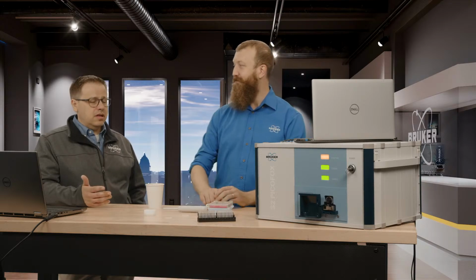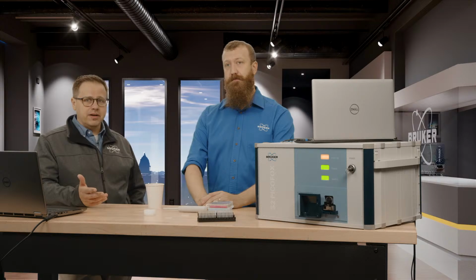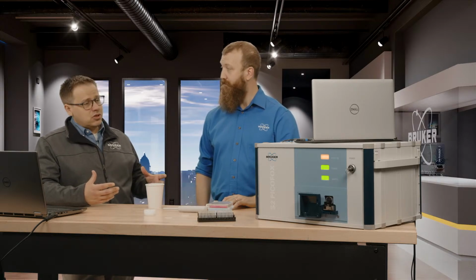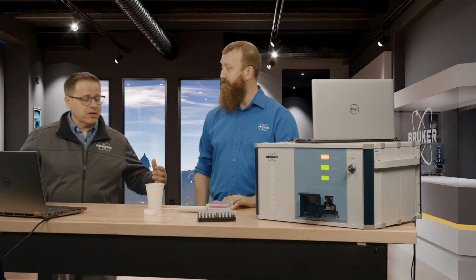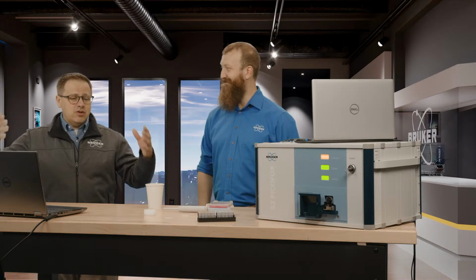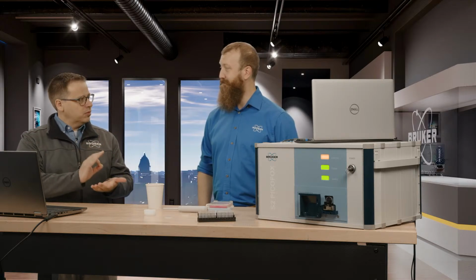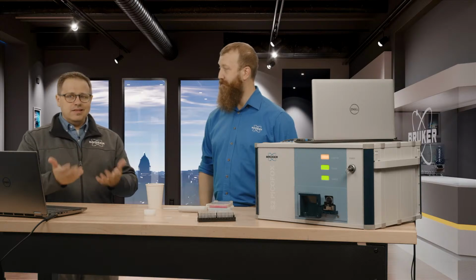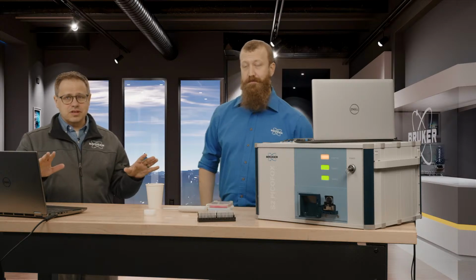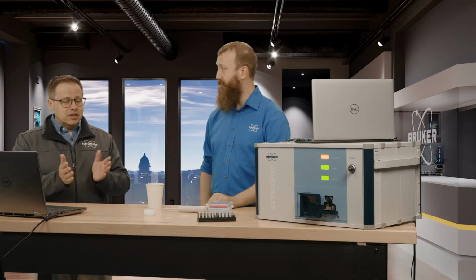So now I heard about this technique about 20 or so years ago. I know we were having a problem in a lot of the fabs where we had aluminum coming in on silicon wafers. And so what they would do is they'd have these machines, and the ones we built, they were like huge. We actually called them goulash pot. It was so big. And you throw in a wafer, and then we'd be checking for just trace parts per billion of aluminum on that silicon. And the idea was, if you get any aluminum in a fab, it just destroys the entire process. You basically tear the fab down, and you got to rebuild.